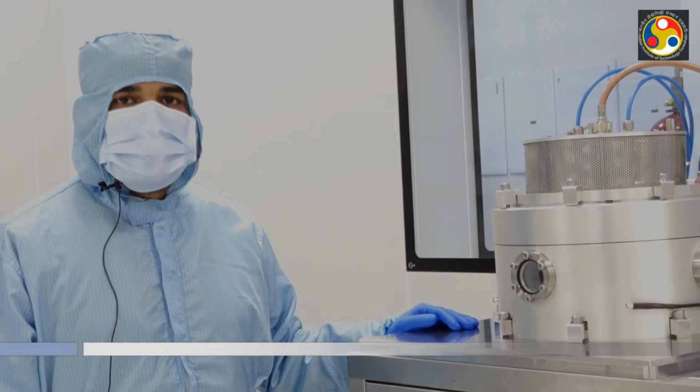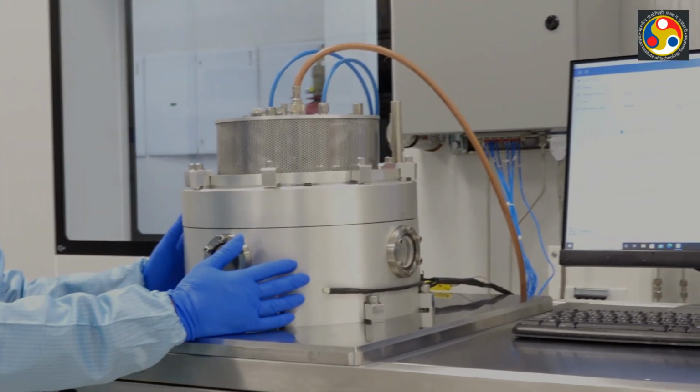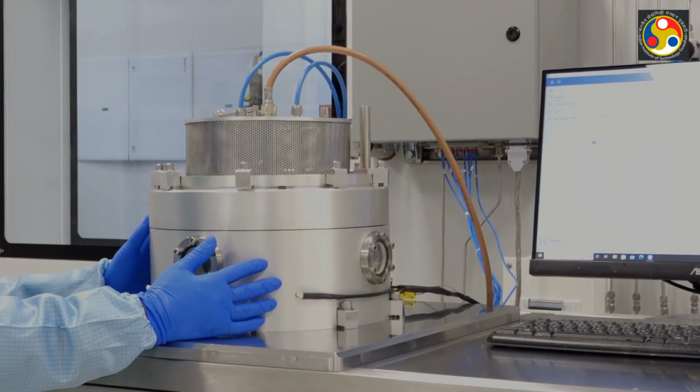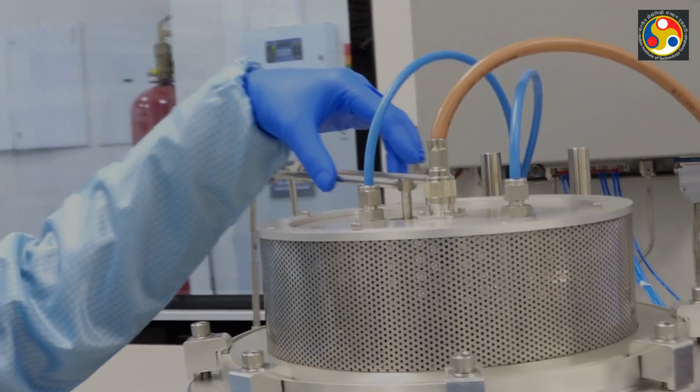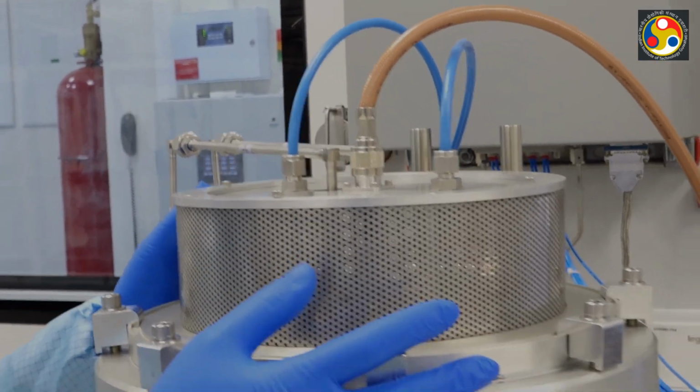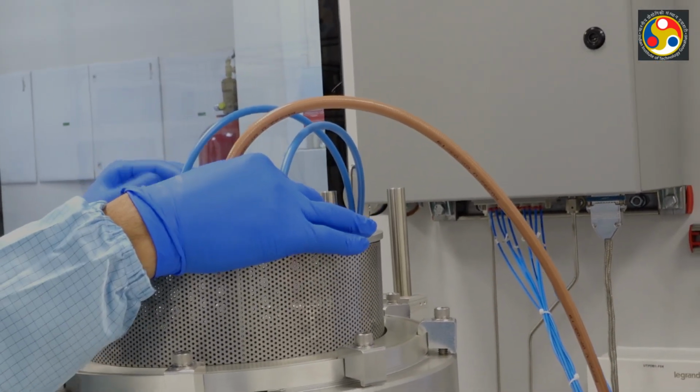So this is PECVD NPE 4000 by NanoMaster. This is the main machine, main chamber in which the PECVD will be performed. You can see these are the gas lines which are coming to the chamber. This is the RF power supply, and this is the chilled water supply.